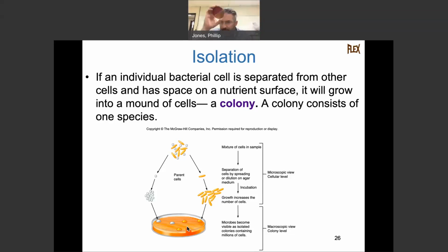Okay, so this is an EMB and a blood agar plate. It's divided in two. So this is selective for gram-negative and differential. One side of this is blood agar. The other side is an EMB, which I just showed you. So that's the color it would start out at, right? And as it grew, it changed. It's got that green sheen to it. So this originally was this site here, that color.